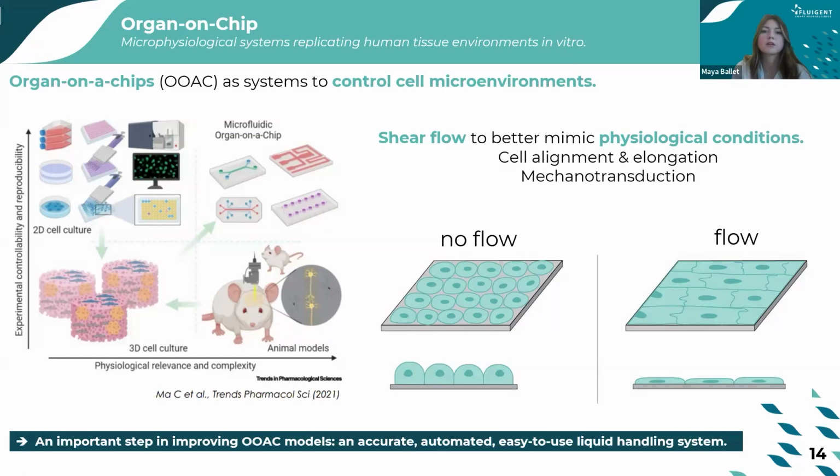But also they polarize, they form tight junctions, they adopt certain gene expression, and they have generally a good, healthy metabolic activity. But if the shear becomes unstable, for example, if there are spikes or pulsations in the flow, then it can trigger inflammation, break cell adhesion, or change the cell phenotype.